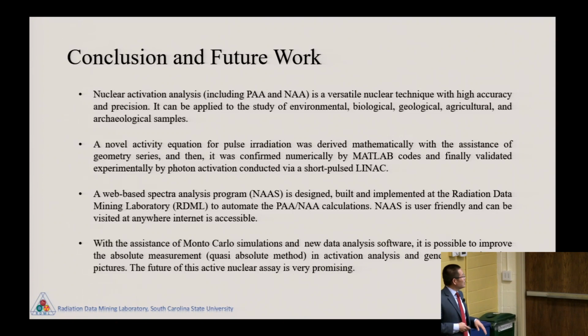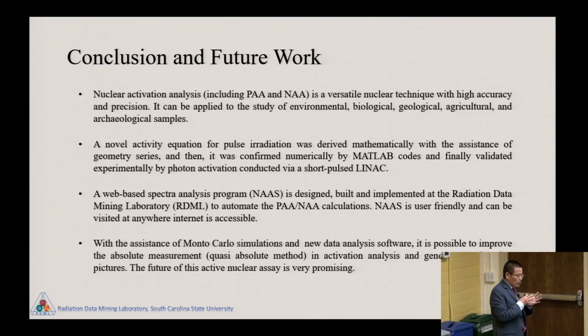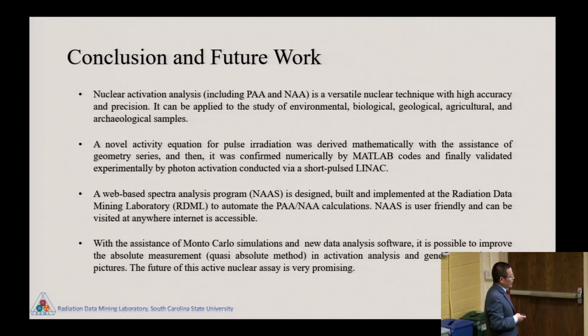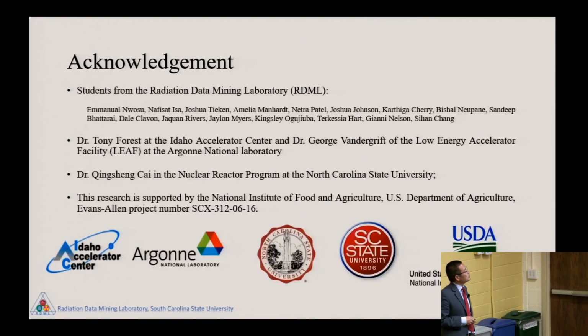It's fine. And with the assistance of Monte Carlo simulations, that's the future work we want to do. And we want to improve the absolute measurement. Right now, it's only in the same order of magnitude. But if we improve the simulations and improve the experimental conditions, maybe we can do it. And maybe we can generate 3D imaging pictures with that technique. So the future of neutron activation is very promising.